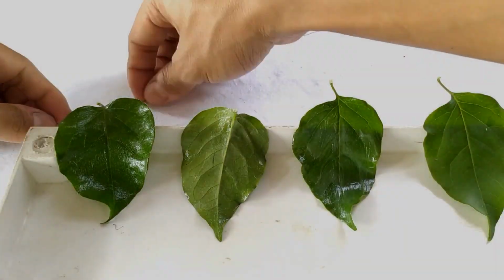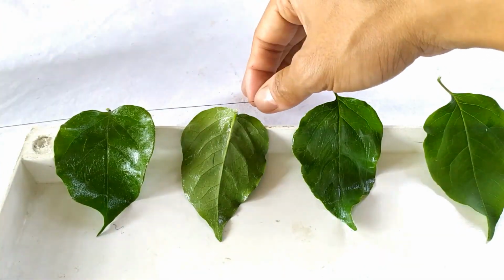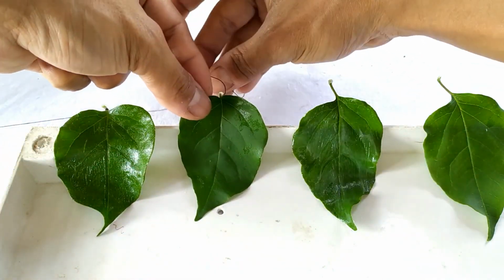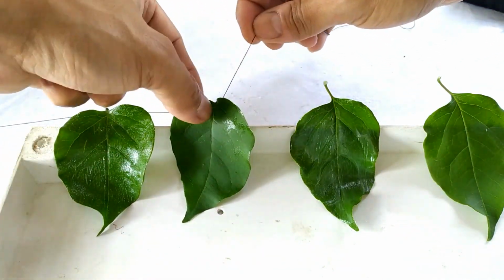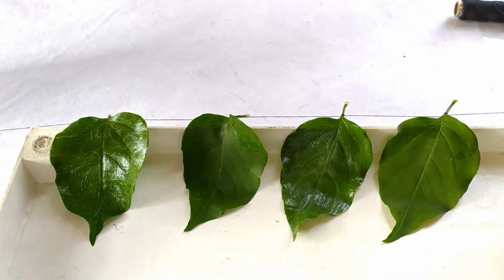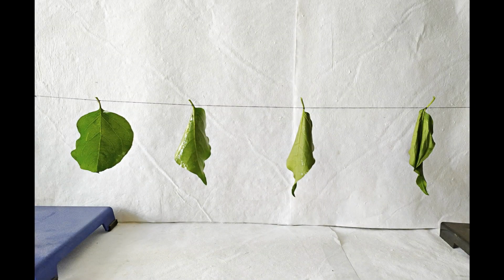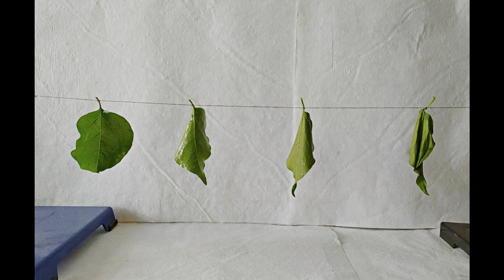Tie the petioles of the four leaves on a long piece of thread like you see here. Suspend both ends of the thread containing the four leaves on the poles of the clamp stands or whatever support that you're using. Leave the setup in bright sunlight for a few hours. Observe the leaves. You will find that some of the leaves have noticeably wilted to different degrees.